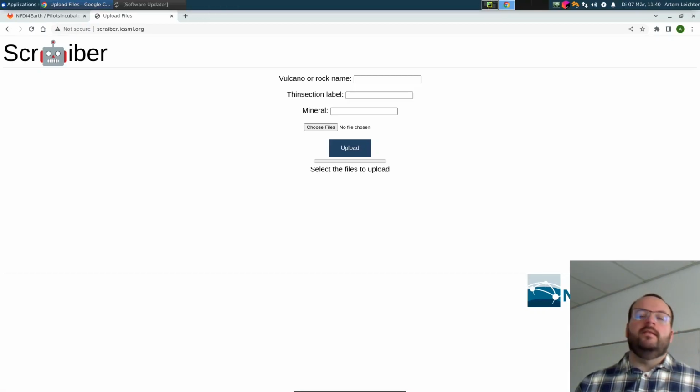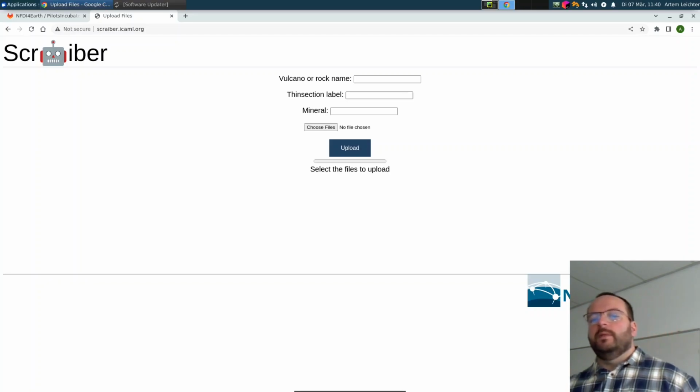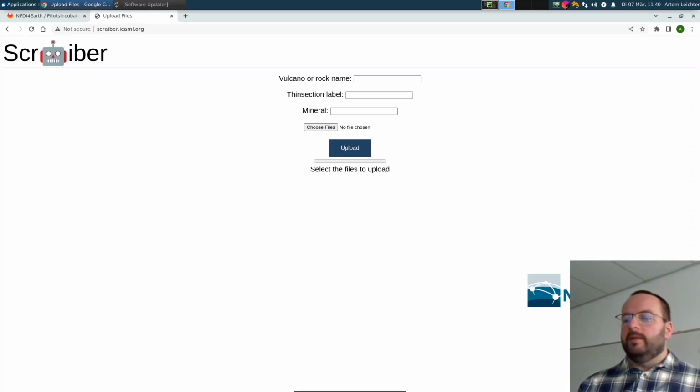Hello everyone, in this video we are going to talk about Scraiber segmentation software. This software has been developed within the project funded by the NFDI, and the main idea is to make machine learning pipelines used within the scientific process, which are only available for Python developers, also available for users conveniently just through a graphical user interface.